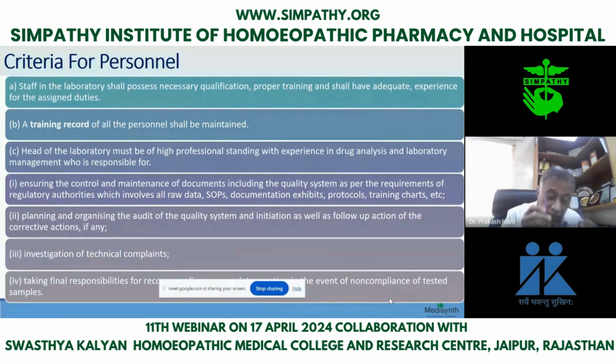That is why in our alcohol monograph, if you see it in volume 9 or 10, it is mentioned that it should be free from all three impurities. These impurities you can test only with GLC. There are different instruments and different ways to test all these things. So the monographs are updated.